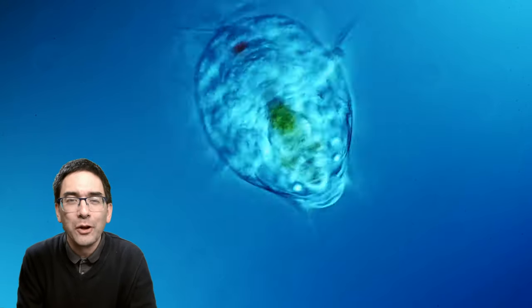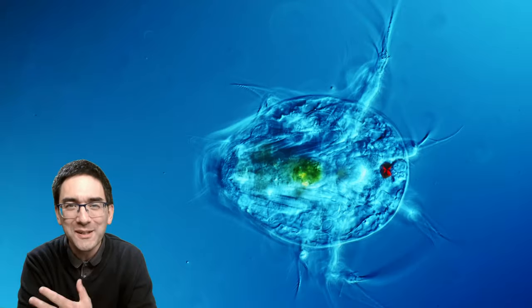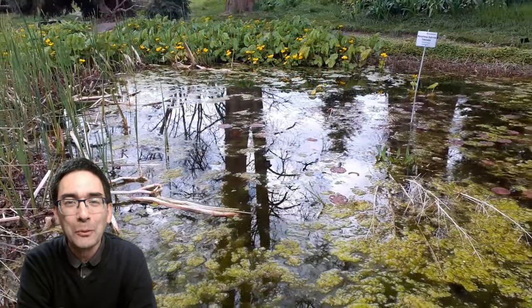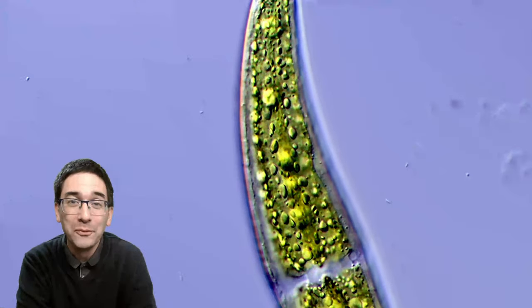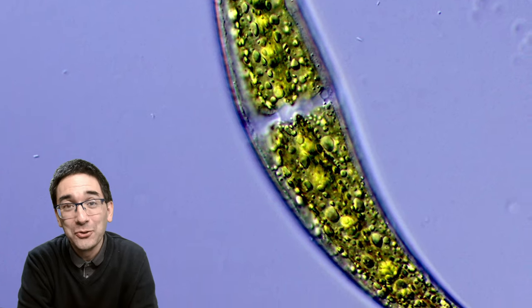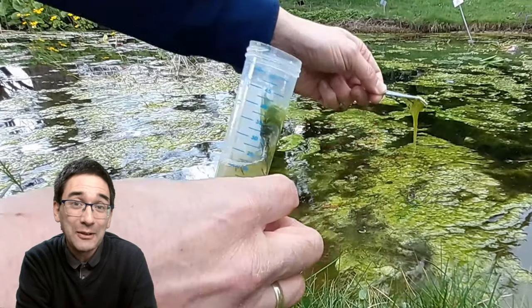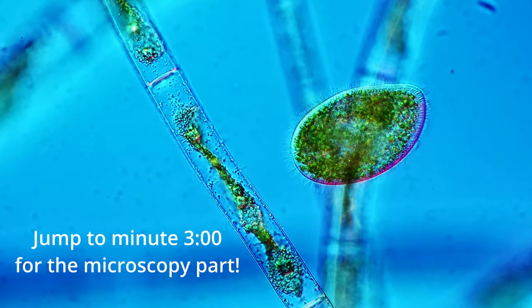This here is a Nauplius larva — the larva of tiny water crustaceans. I found this particular critter in the pond of the local botanical garden, along with a couple of beautiful green algae. Today I'm going to show you how I collected them and later some more interesting water microorganisms.